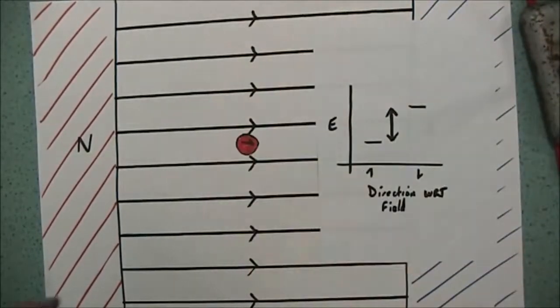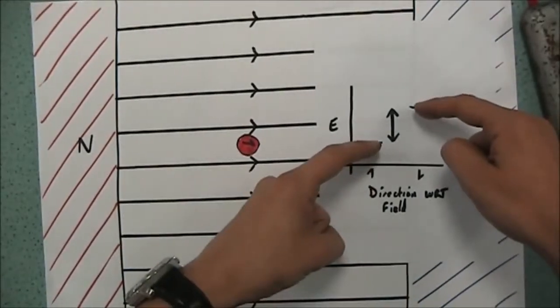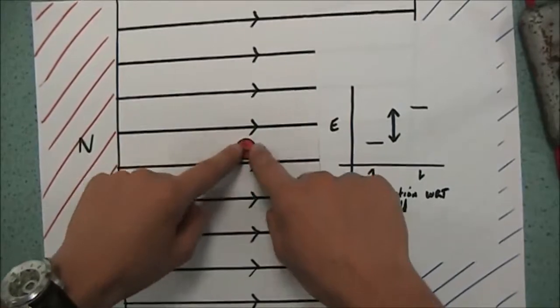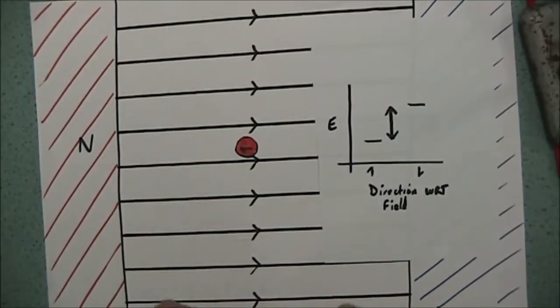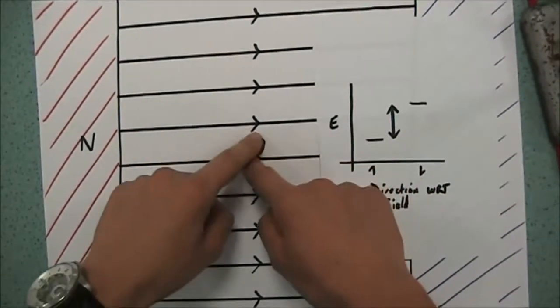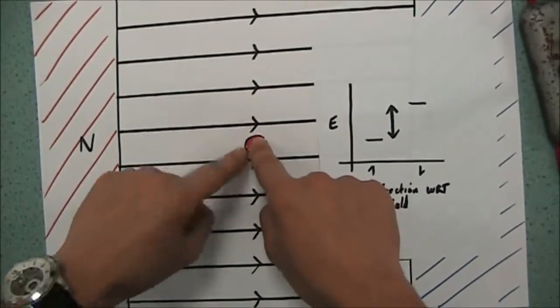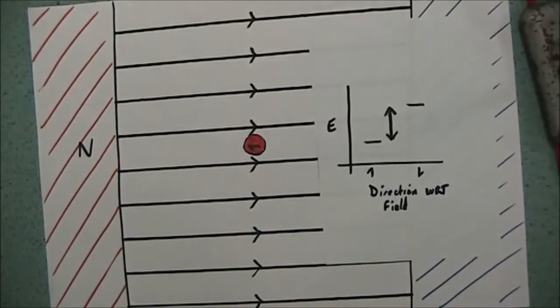And what we can do is measure those radio waves. The more of a difference there is between here and here, the bigger the energy gap, and therefore the higher frequency there is of the radio waves. So what we're doing is measuring how different this nucleus is when it's this way round compared to turning it against the field this way round.